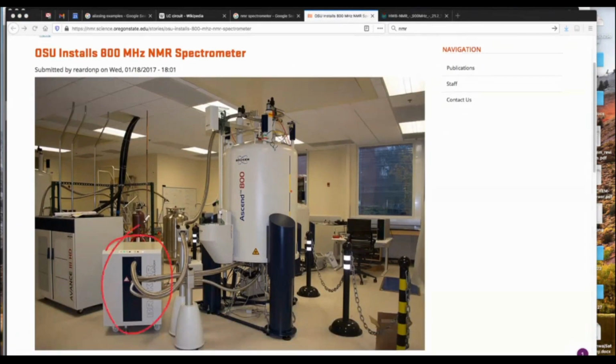So what you're able to see here is once again an 800 megahertz magnet, and you have a separate helium pump. The moment you want to go to 20 Kelvin, you have to use helium. Helium is expensive. This is the console I was talking about. This is the magnet we were referring to. These are the legs, these blue things. Not able to see the back leg, but I think you see a little glimpse of it.